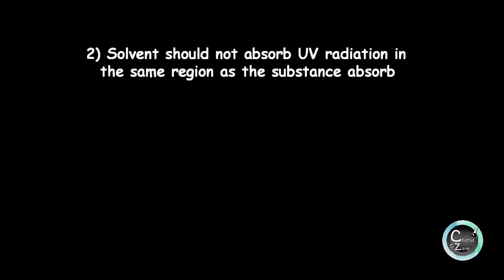That is, the solvent should not absorb UV radiation in the same region as the substrate whose spectrum is to be determined.